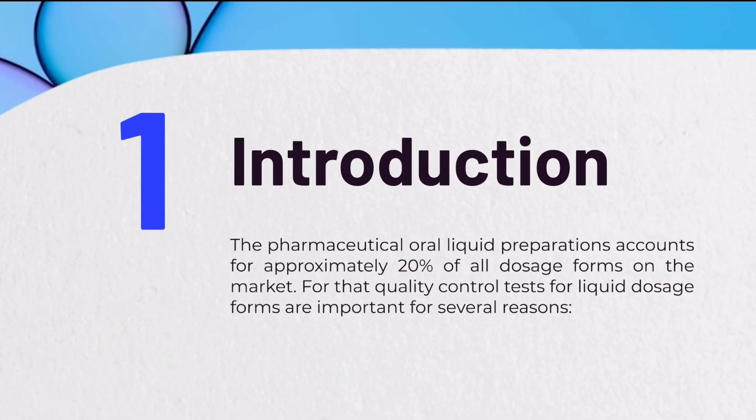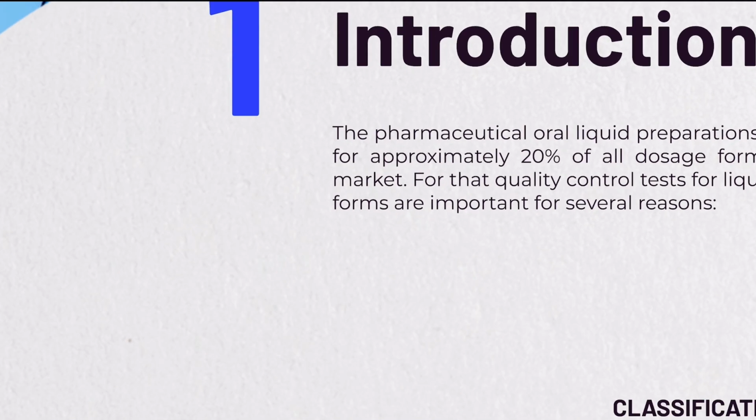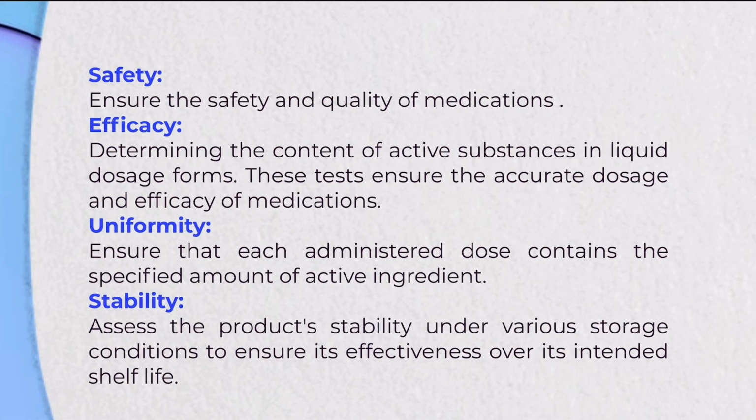First point, introduction. The pharmaceutical oral liquid preparations account for approximately 20% of all dosage forms on the market. For that, quality control tests for liquid dosage forms are important for several reasons. First, safety, to ensure the safety and quality of medications.